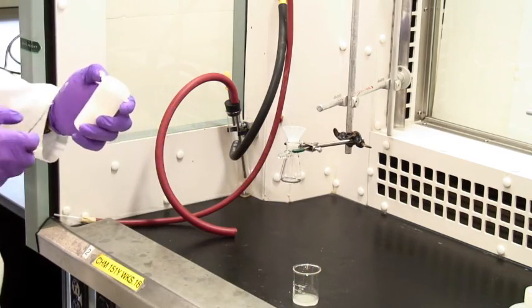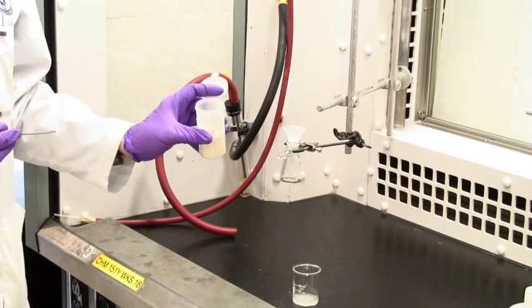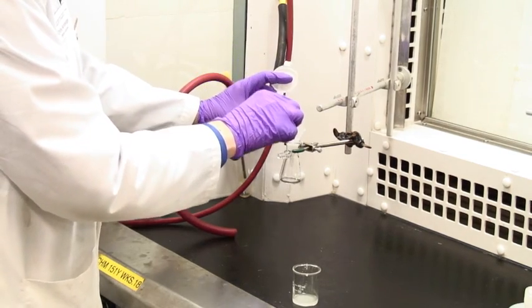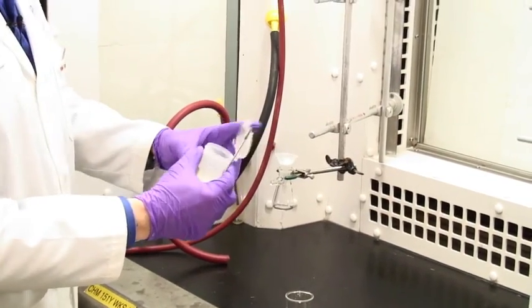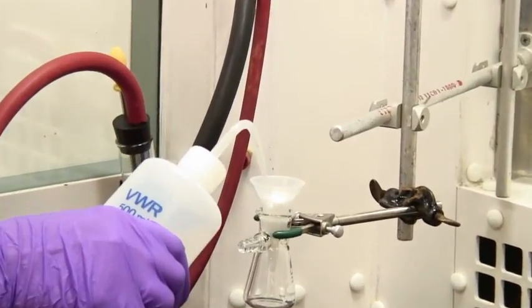This particular kind is called Celite. There are many others. It's a fine powdered solid. It looks like fine sand or flour. You take an amount of it, about like that, pop it on your filter and add some solvent to get it wet.